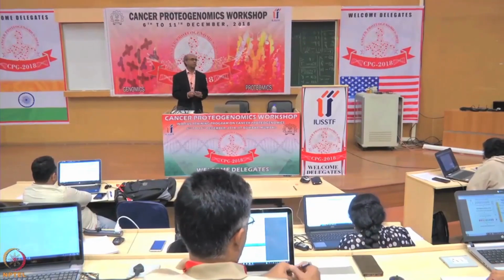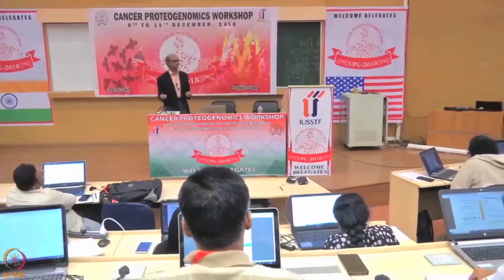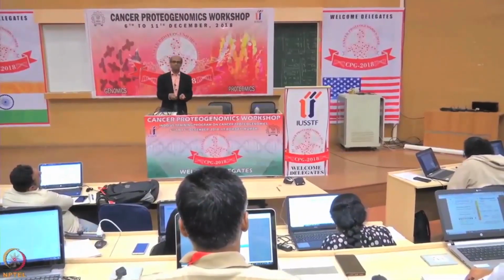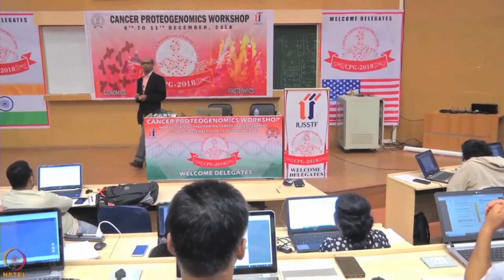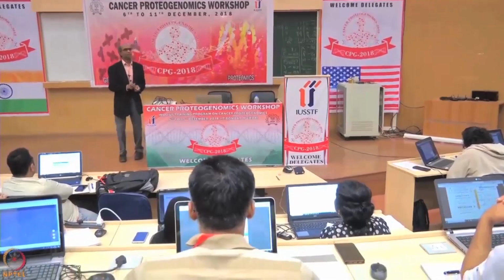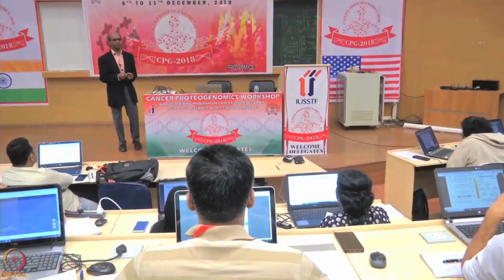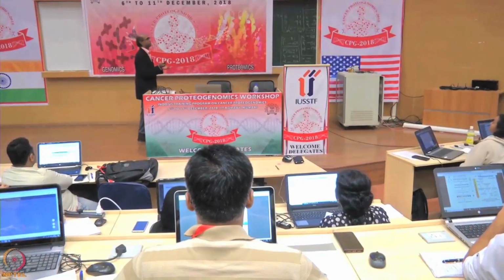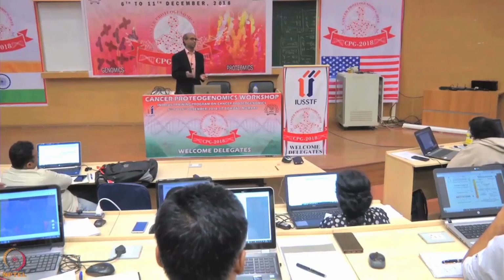Or in your hands-on, we are going to look at Prodigy, which has 2-component normalization implemented in it. You can explore that on your own. I think we probably won't do that today because it takes a while to do the normalization, so you might want to try it on your own. But in general, this one and median MAD are what we generally look at unless there is a reason not to.